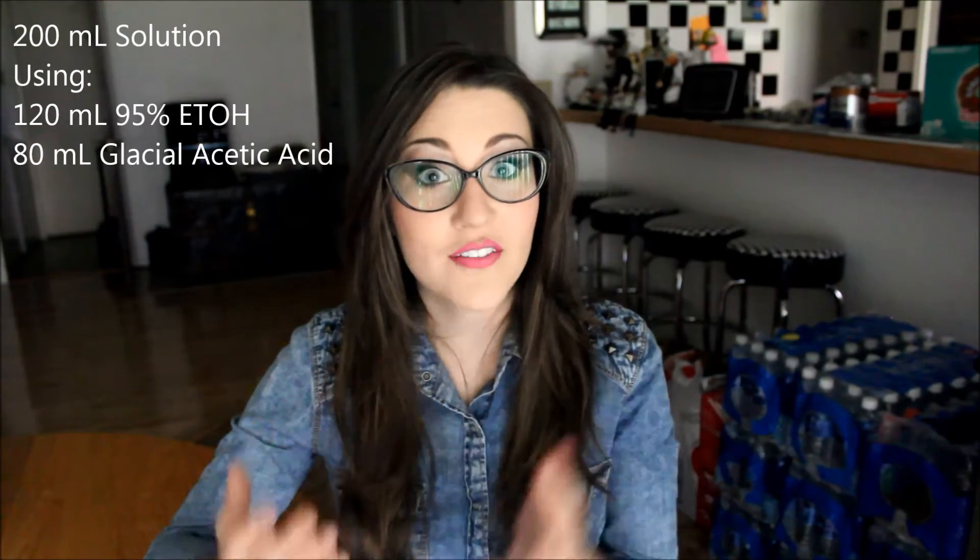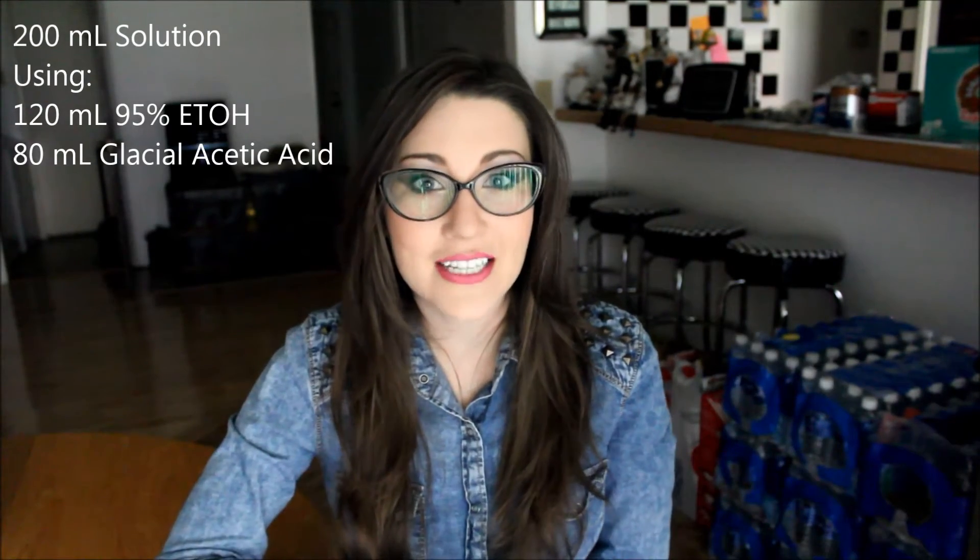So instead of 100 milliliters, I am going to be preparing 200 milliliters. It's still going to be a 3 to 2 ratio — 3 parts ethanol, 2 parts glacial acetic acid. All that's going to change is the amount of each that's needed. Since I am preparing 200 milliliters, I am going to be using 120 milliliters of the ethanol and then 80 milliliters of the glacial acetic acid. And since we are increasing our solution, we are also going to increase the amount of powder — so instead of 10 milligrams of Alcian Blue powder, I am going to be using 20 milligrams.